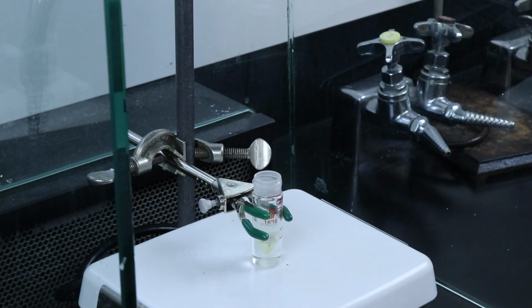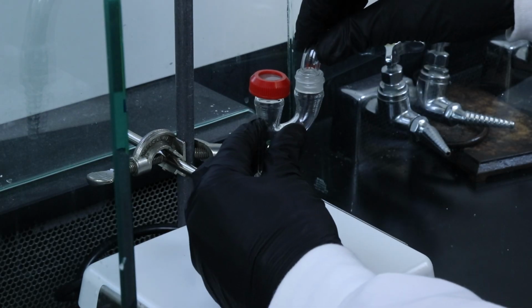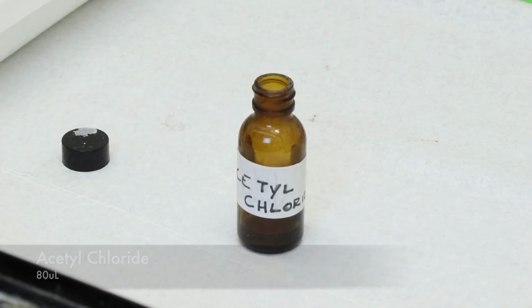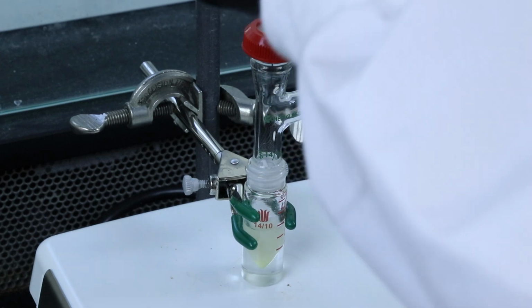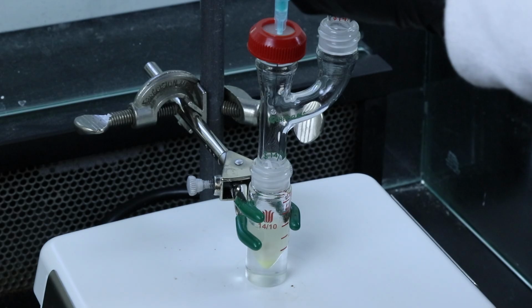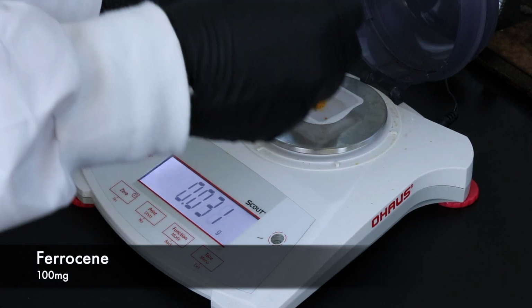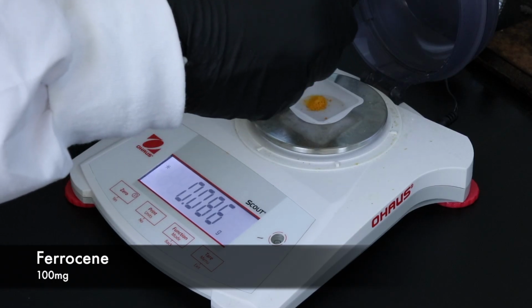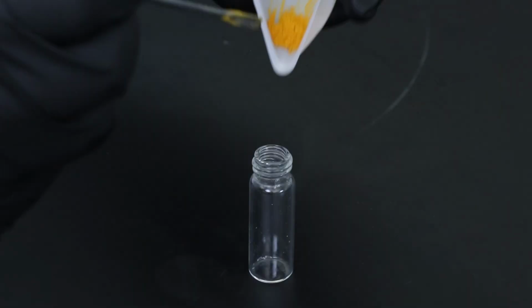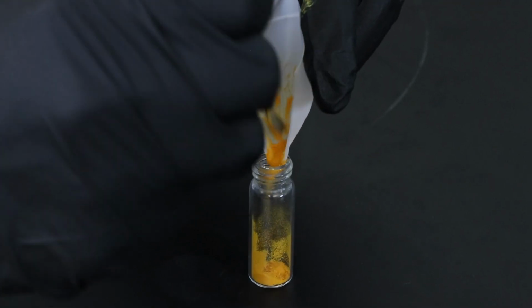And I'll set up the apparatus now so I can add the rest of the reagents with a needle and a syringe. I'll get 80 microliters of acetyl chloride and add that to the conical vial as well. And finally, I can add the ferrocene, so I'll weigh out 100 milligrams of that, and I'm going to be dissolving it in a milliliter and a half of methylene chloride, so I'll put it in a dram vial where I can later add the methylene chloride to dissolve it.